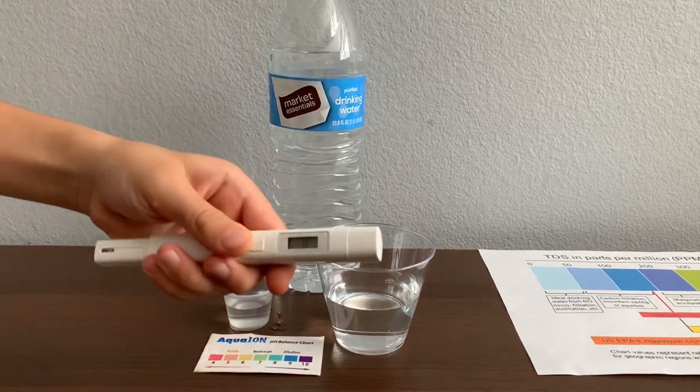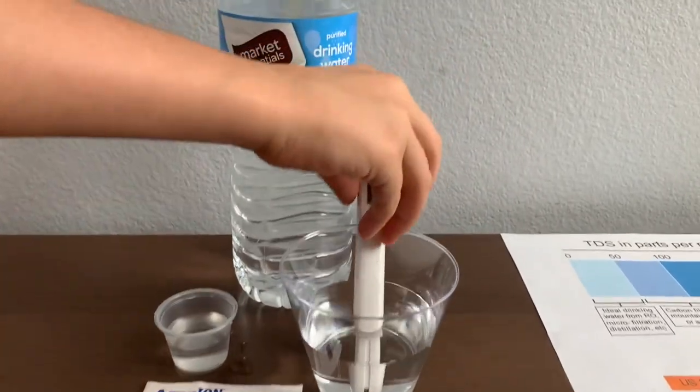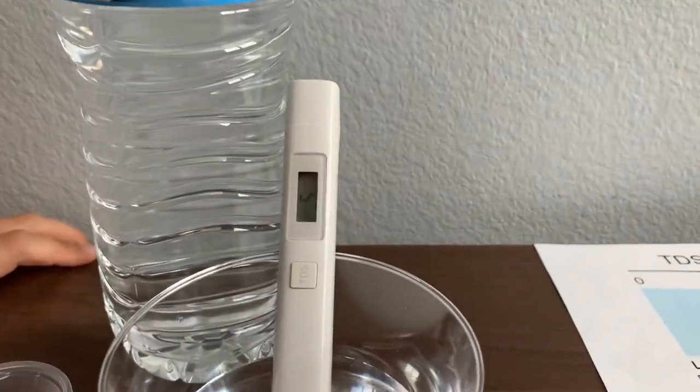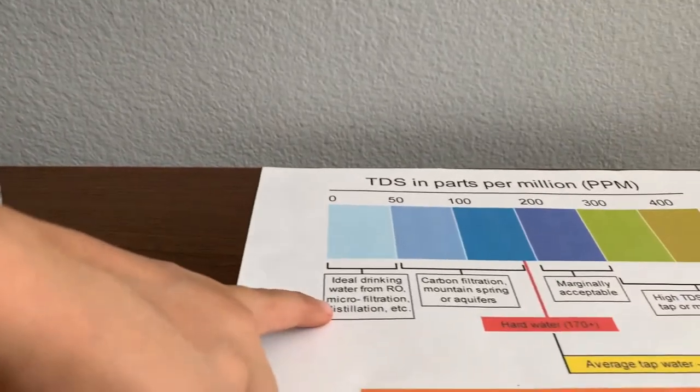First we're going to test the TDS level. Turn on the TDS tester, make sure it says zero, and put it in. Five — that is micro filter distilled water quality.